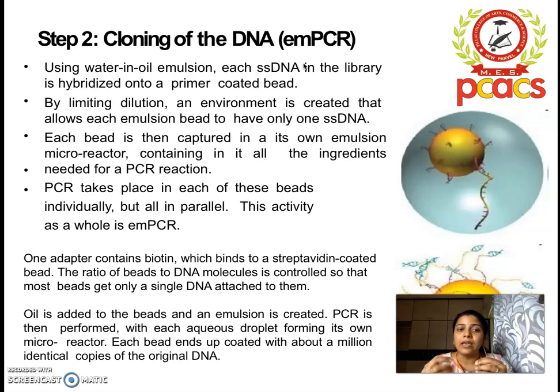Okay, and then the dilution is such that every emulsion bead will have only one. So these beads are there and you will be adding your single stranded DNAs. The single stranded DNAs would be fewer and the beads would be more. So when you have a competition, what will happen? One bead will have only one single strand. You can see over here, you have one bead, to which only one single template is going to be added. So that is how the dilution has to be maintained.